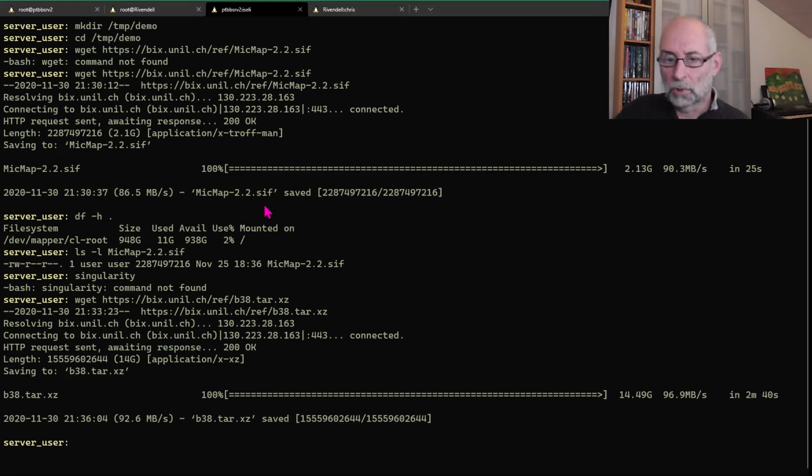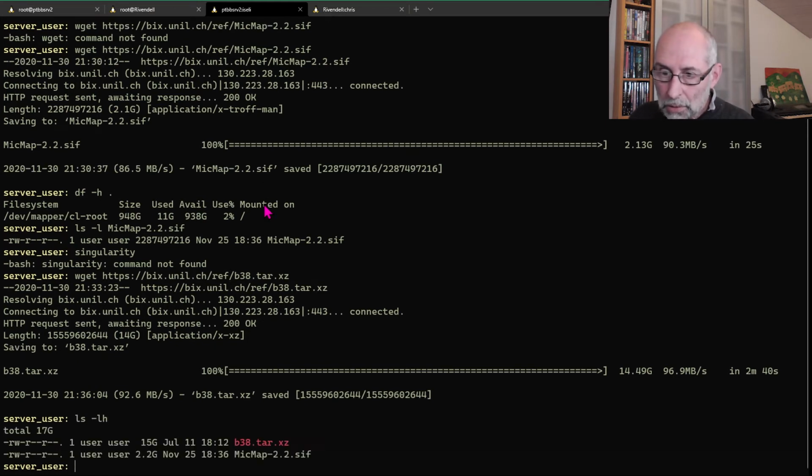So meanwhile the download of the tarball completed. So let's see. We can now unpack this.